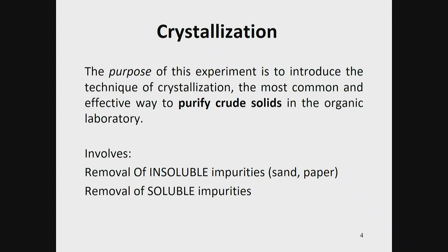So we're going to take a solid and we're going to use a solvent or a liquid to help to purify that solid. This is very useful for organic chemical synthesis. Imagine that you've synthesized a chemical, you've conducted a chemical reaction, and there's leftover starting materials or byproducts that are causing impurities in your final product, so you will employ this technique of crystallization to clean up that product that you made.